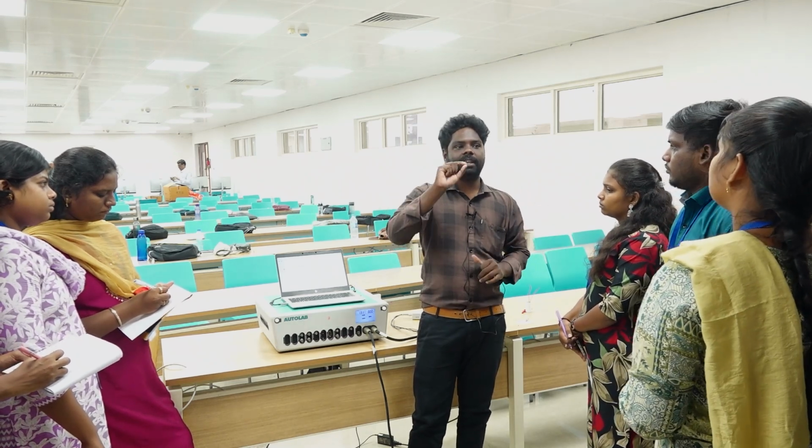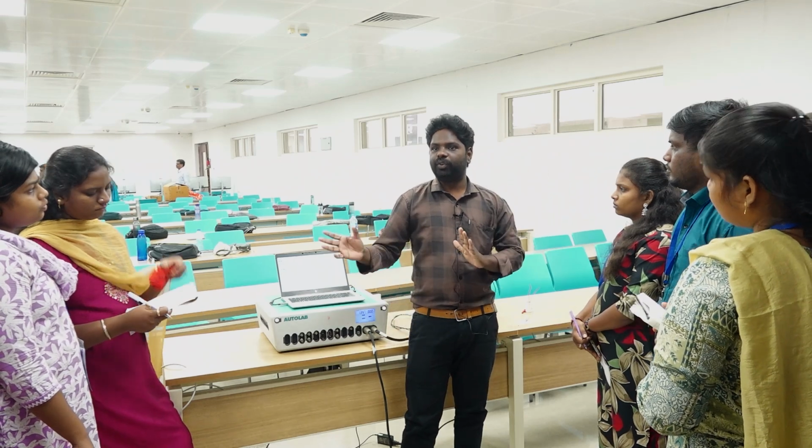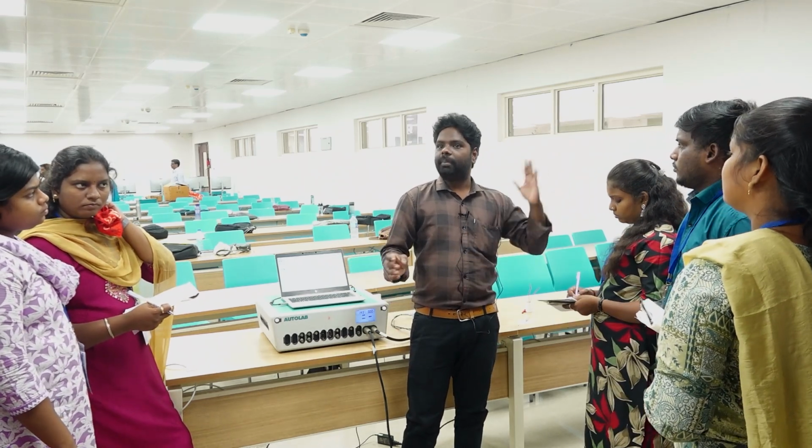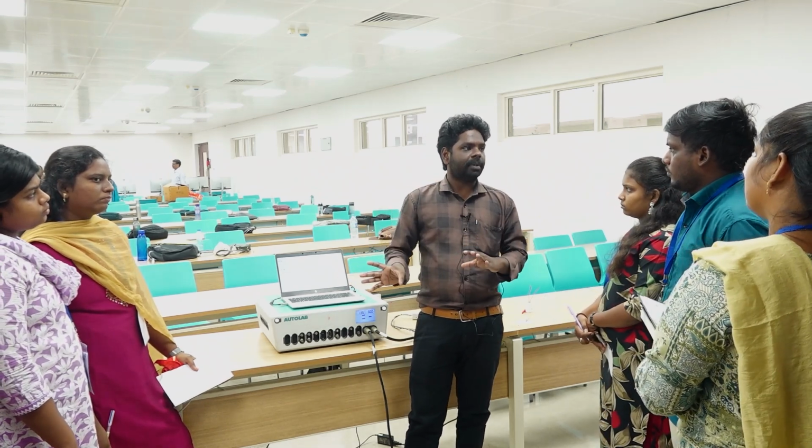In other techniques like CV, we apply either voltage or current. But in EIS, we simply apply a sine wave, frequency only, sweeping from high frequency to low frequency. In this frequency range, we will get the complete behavior of our sample.